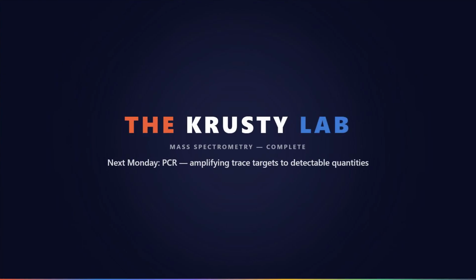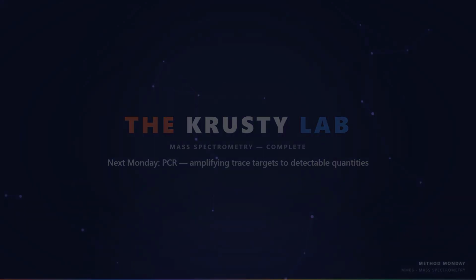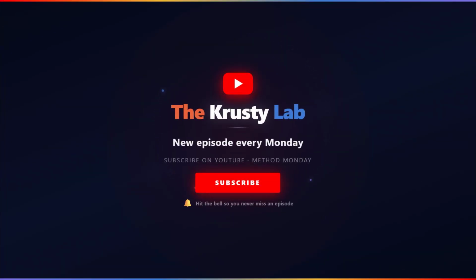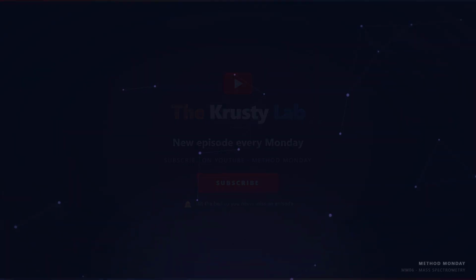Mass spec tells you what is in your sample. But if what you are looking for is one copy of a viral genome in 10 million cells, mass spec cannot see it. There is not enough material. To detect a target that is present in trace amounts, you have to make more of it first. Next Monday, PCR. Method Monday.